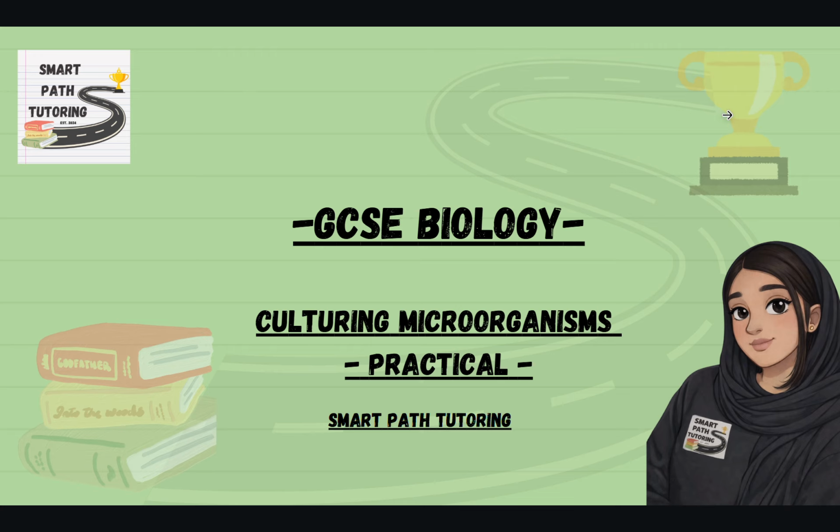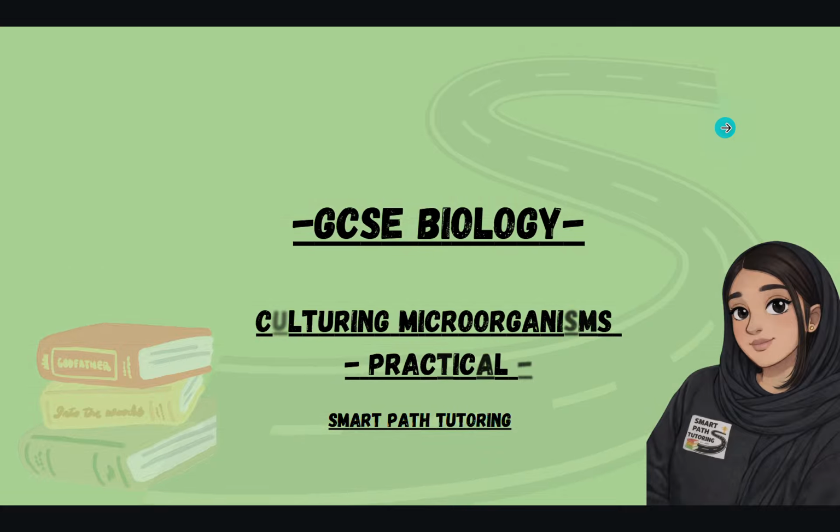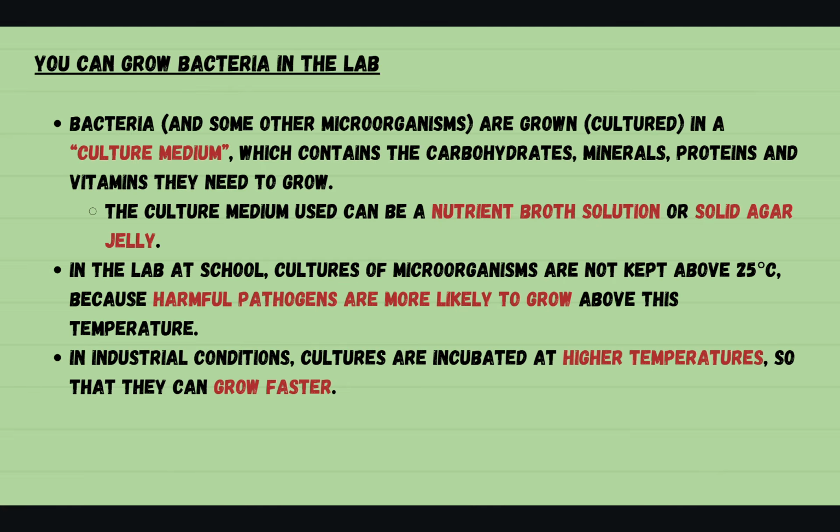Hey guys, in this video we're looking at GCSE Biology, culturing microorganisms and the practical alongside it. You can grow bacteria in the lab. Bacteria and some other microorganisms are grown, also known as cultured, in a culture medium, which contains the carbohydrates, minerals, proteins, and vitamins they need to grow. The culture medium used can be a nutrient broth solution or solid agar jelly.